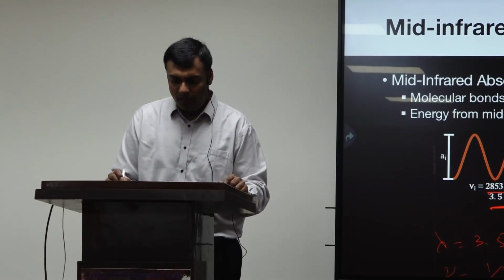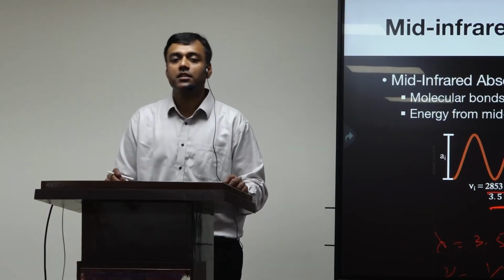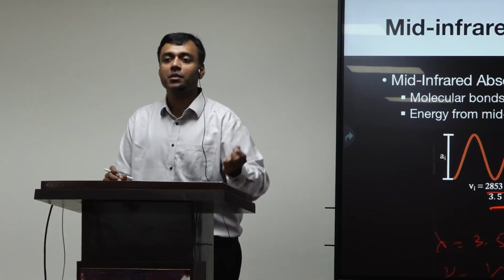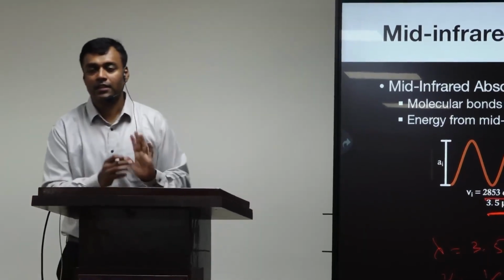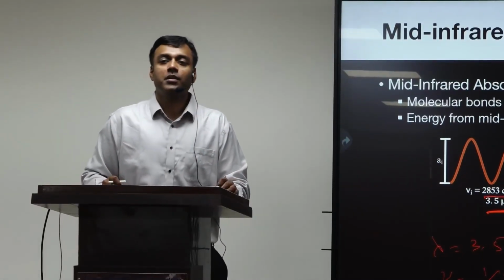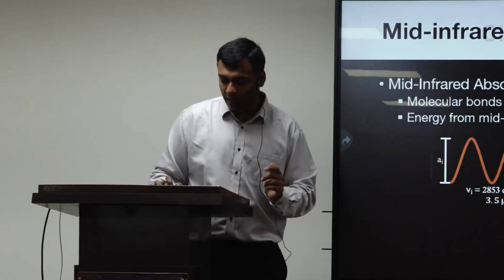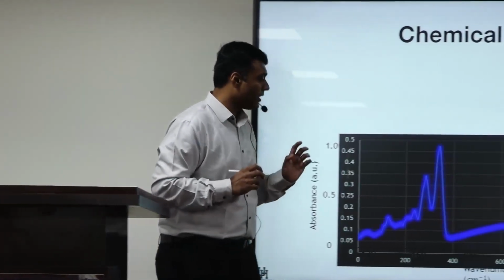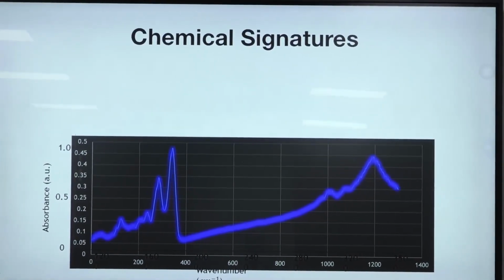Okay, so what's the point of finding the chemical composition? Say in some diseases, the chemical composition could change. So if you measure the change in chemical composition, you can figure out what disease it is. We'll get there in a minute, but that's the reason why this could be useful for biologists, and for medical and clinical purposes. As I mentioned, for one chemical, you can figure out what's going on. But what if it's not a single chemical?